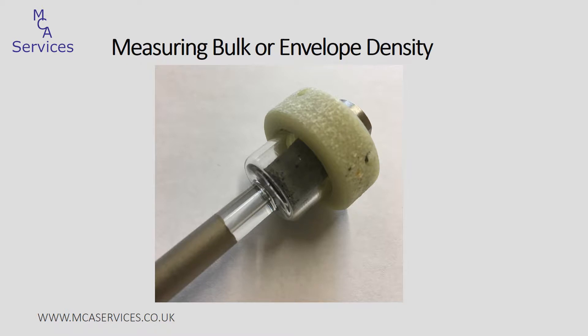The first thing we do is to weigh the sample. We then load it into a penetrometer — that's this glass bulb here with a stem attached to it. It's sealed with a metal cap at the top and then a green ring to hold everything in place. The penetrometer has also been calibrated for its volume, so we know the volume of the empty penetrometer. It will now be loaded to the Autopore.